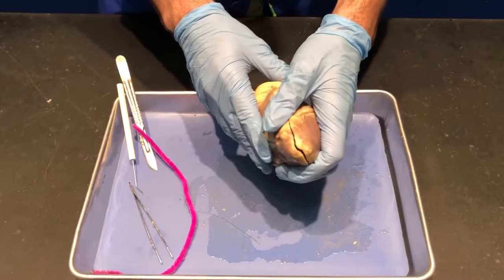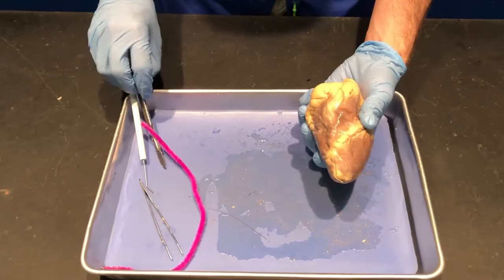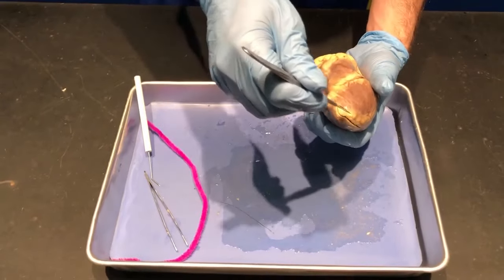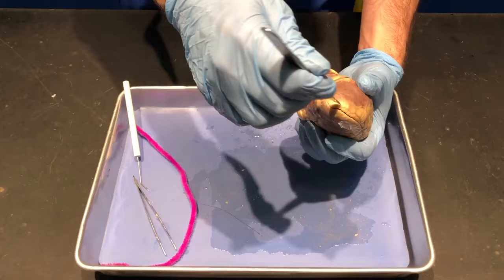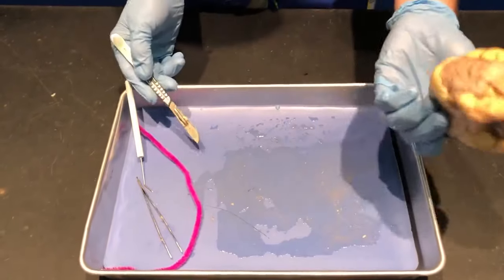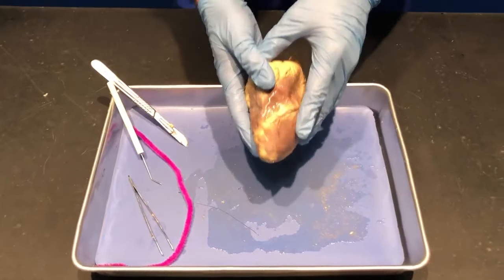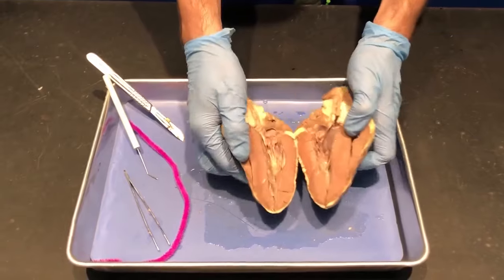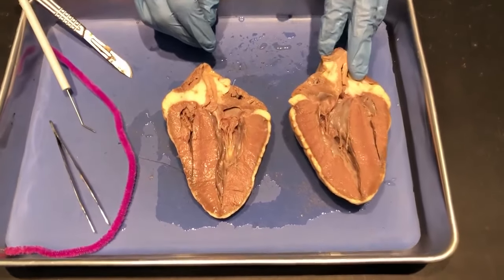I already cut this one open just to make my job a little bit easier. Before I open this up I'll show you how we do open up our hearts here — we normally start up here at the apex and with a super sharp scalpel we make an incision, then go all the way around, cutting through as much as we can until we cut all the way through. So let me go ahead and show you what we have in here.